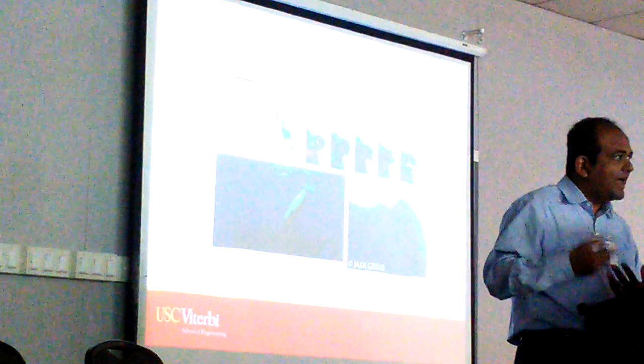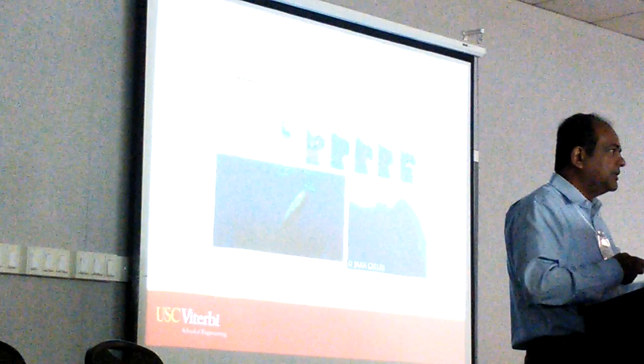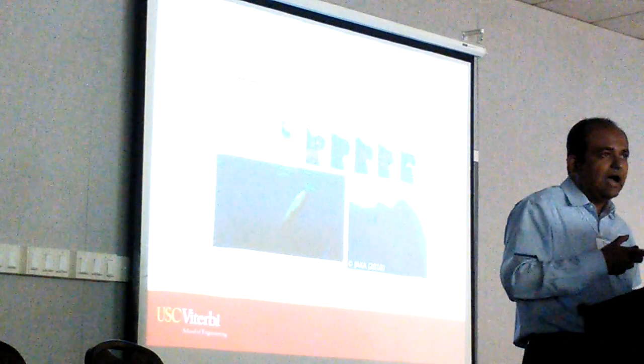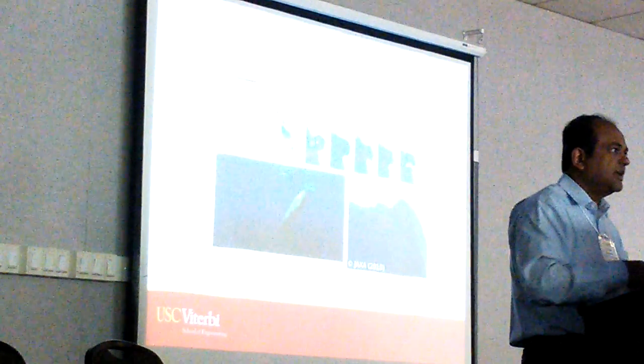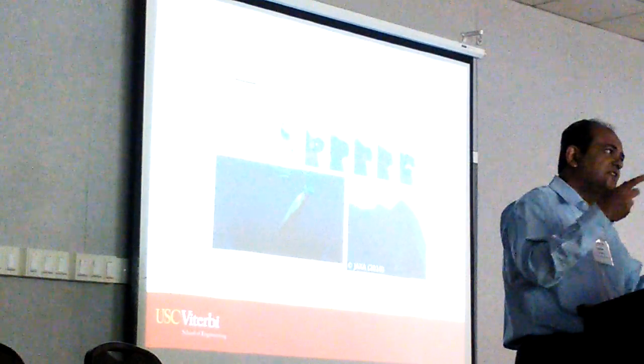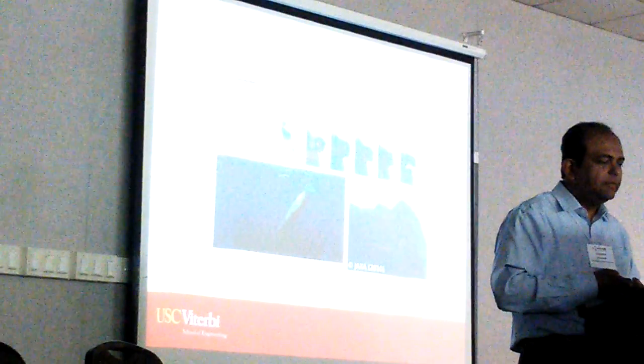The analysis in batch offline. So when you come back in the evening, you have 10 water samples, you can run them and you can say, so-and-so sample had this distribution of species in it, and so-and-so other sample had this distribution of species in it. And maybe that governs what you do tomorrow. You go out and sample for some other species.